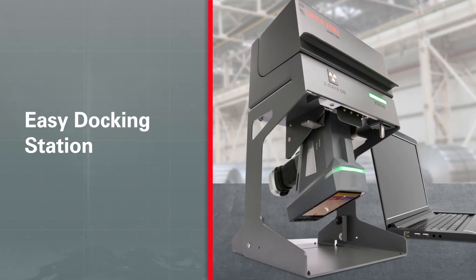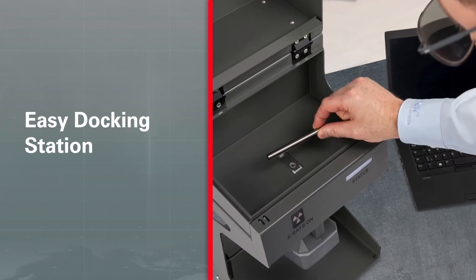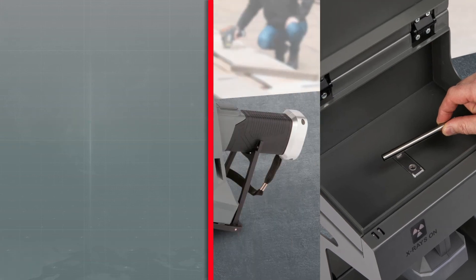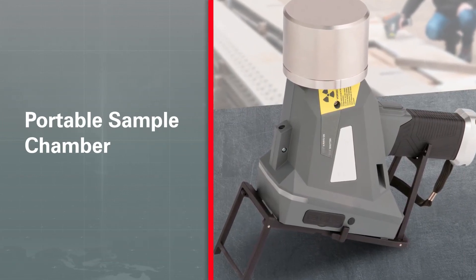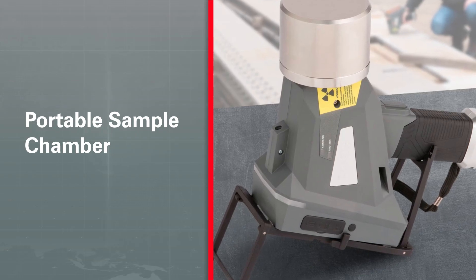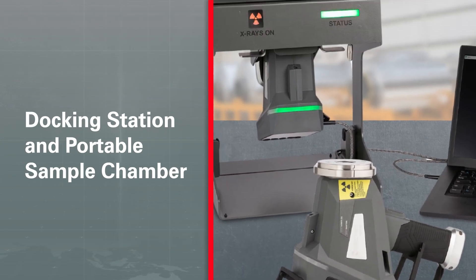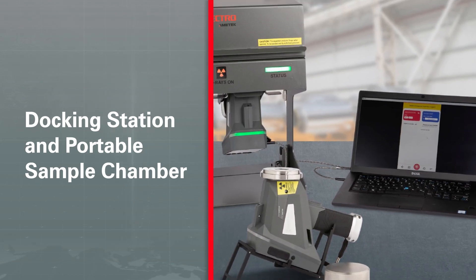An optional docking station enables fast, easy instrument insertion — ideal for stationary operation when testing small parts such as chips or turnings. Another, smaller option is a portable sample chamber; use it on the go as a mini lab. For both the docking station and sample chamber, operators can control the docked unit using a PC, notebook, or Android phone or tablet, wirelessly or via USB.